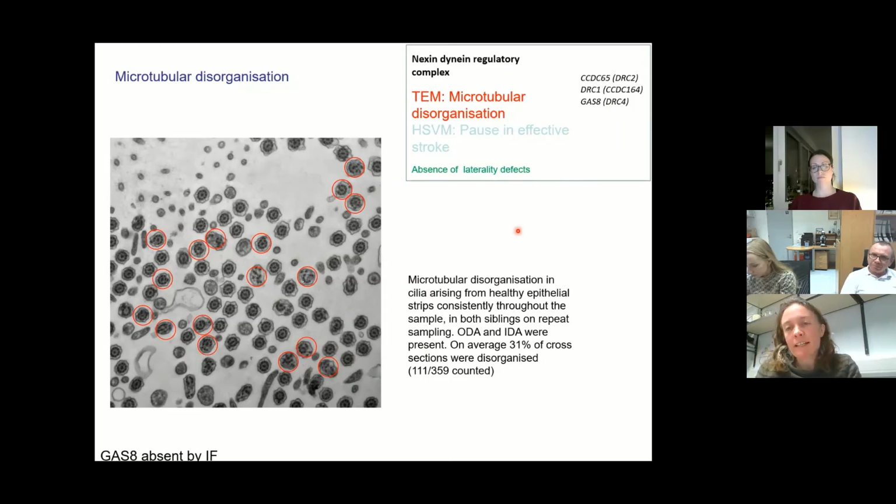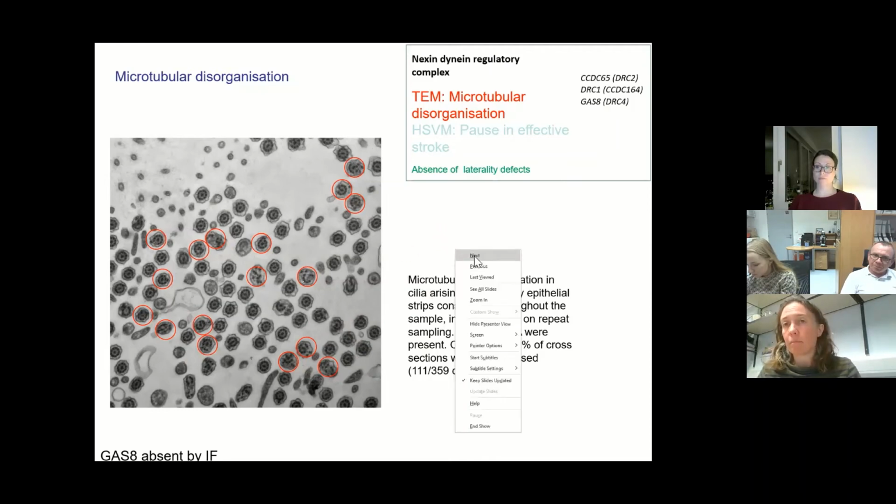And when we made the consensus guideline, interestingly, we weren't going to include this because you do see secondary disorganization quite a lot. But when we did our grid swap, it was one of the best things that people were good at identifying.